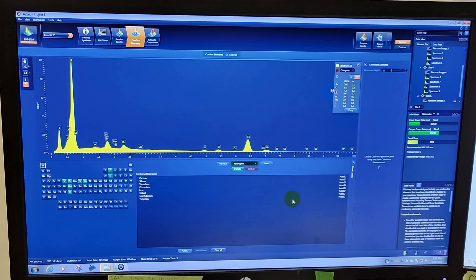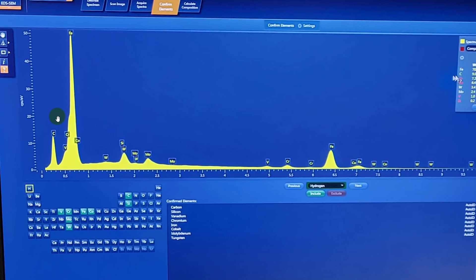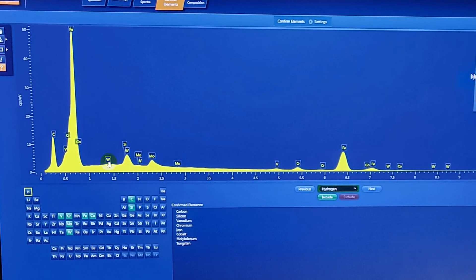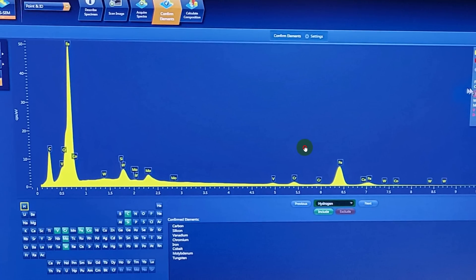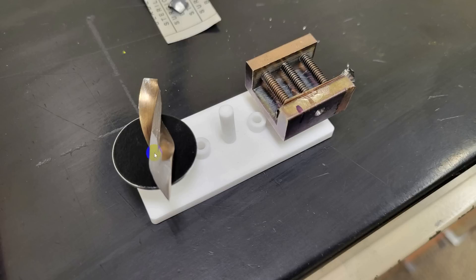After fishing around for a while to try to find a clean area on the sample, this is the spectrum that we got. And this is from the bright silver portion of the break that we speculate was new, so was not oxidized. And we see pretty much what we would expect: chromium, vanadium, cobalt, tungsten. Everything here is exactly what we should expect from a clean sample. Notably, there's no oxygen detected. The golden oxide layer on the outside of the drill should contain oxygen, and so in the clean silver portion of the break there shouldn't be any.